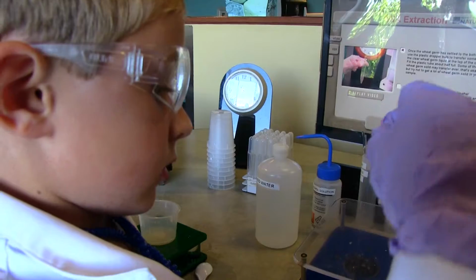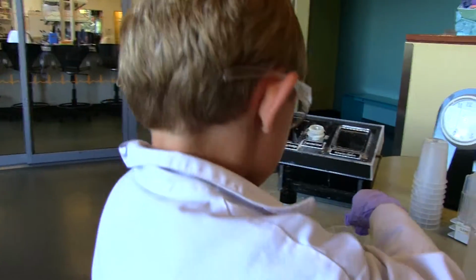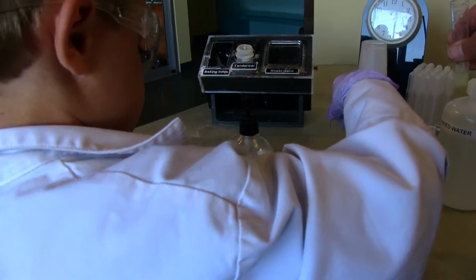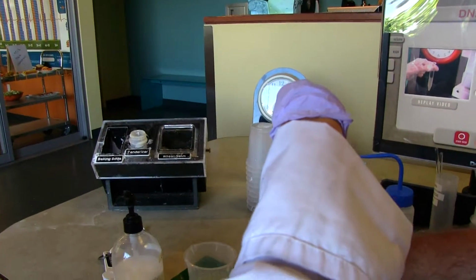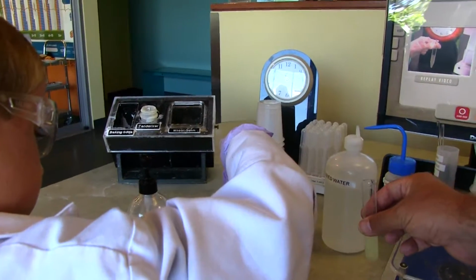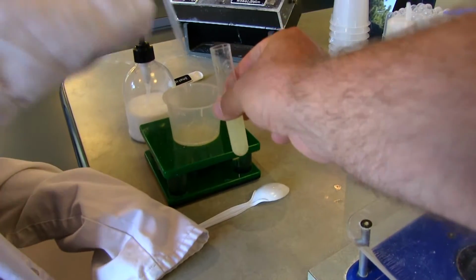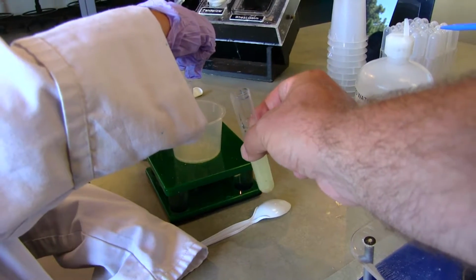Okay. Keep going and fill it up about halfway. Keep putting liquid in, just the liquid on top. No, not all the way. Right, just the top. Squeeze it back out. Just get it off the very top, just like you did before. There you go. Squeeze that in there. Okay, let's do 2 more, just like that. Off the very top. 1. Last one.